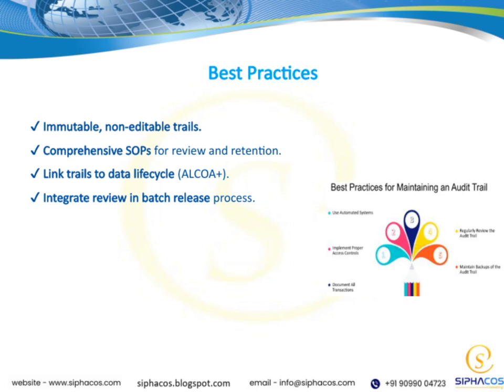It's also important to link our trails directly to the data lifecycle, following the ALCOA plus principles: attributable, legible, contemporaneous, original, accurate, and complete. This alignment helps us maintain data quality from creation to archival. Finally, integrating the review process into the batch release workflow ensures that data is scrutinized regularly and systematically, reducing risks and supporting compliance. By following these best practices, we're not just safeguarding data, but also reinforcing the overall integrity of our processes, which aligns perfectly with our goal of delivering high-quality, compliant products.